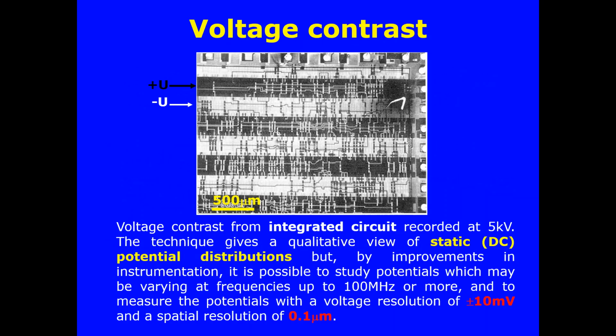So here is a good example of voltage contrast. Here you can see it in this micrograph. What does it actually show, and what sort of information do we get? It is a voltage contrast from an integrated circuit.